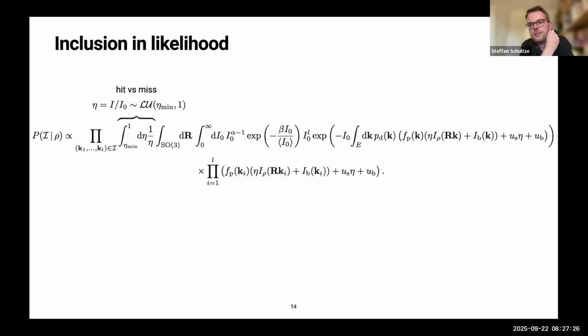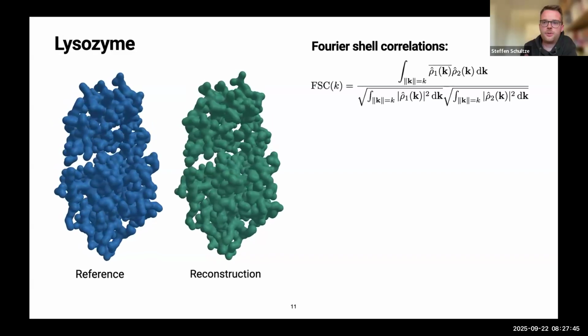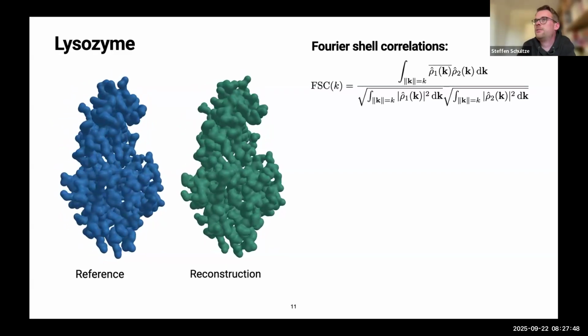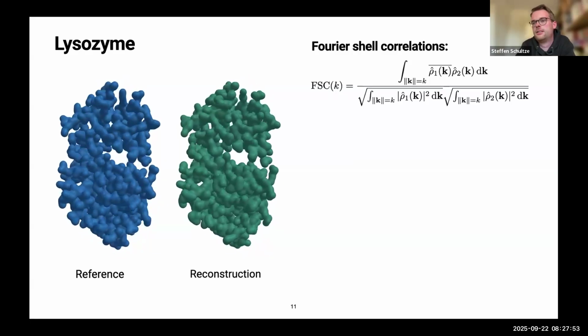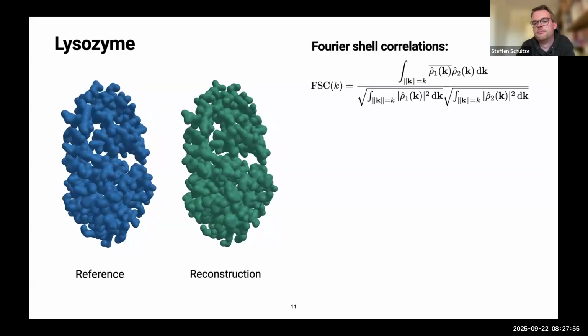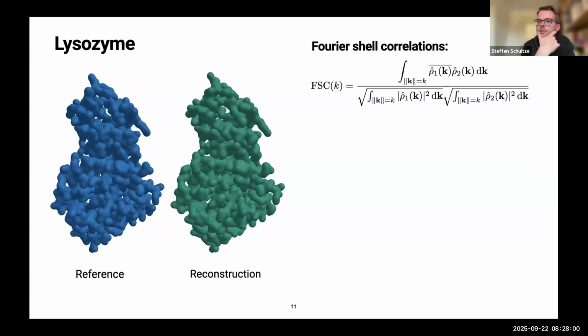I guess so. I guess I'm looking for some sort of magic method to make sure that I'm doing my integrals right. And it sounds like it's one of those things that you really have to test yourself. No, I don't really know, other than, you know, if it works, then yeah. Something else I can say is that the resolution I have in the lysozyme case of 1.9 angstrom, I think the limit from the number of base points I have used would be 1.6 angstrom, if that gives you an idea. That was then 80,000 base points for the orientations.